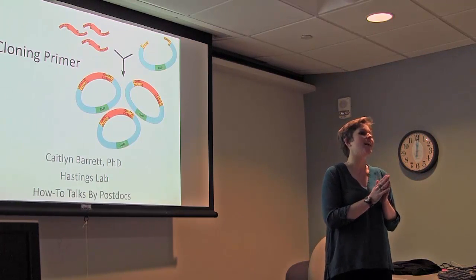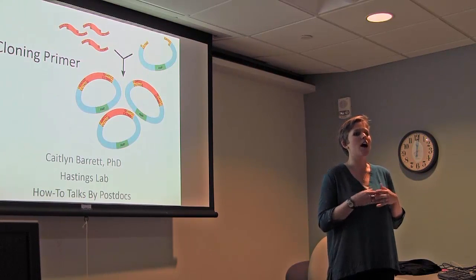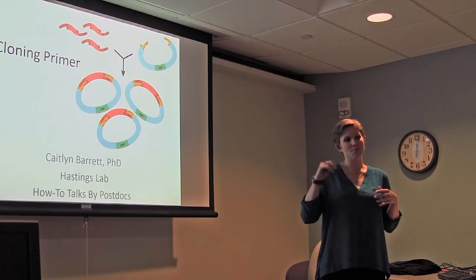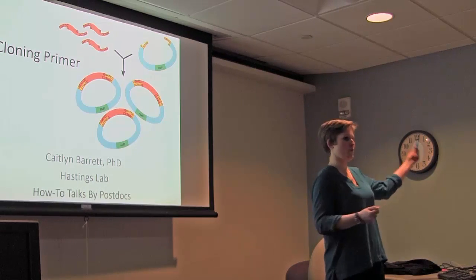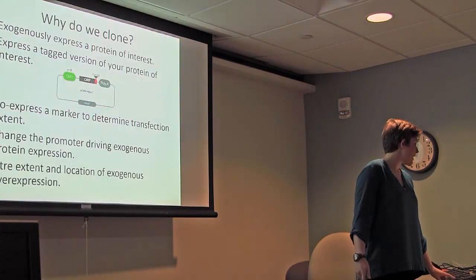So cloning can be a lot easier than it seems and than it has been in the past, because there are a lot of new systems that have been developed that make cloning as easy as popping an insert out of one place and into another place. So that's what we're going to basically be doing today.